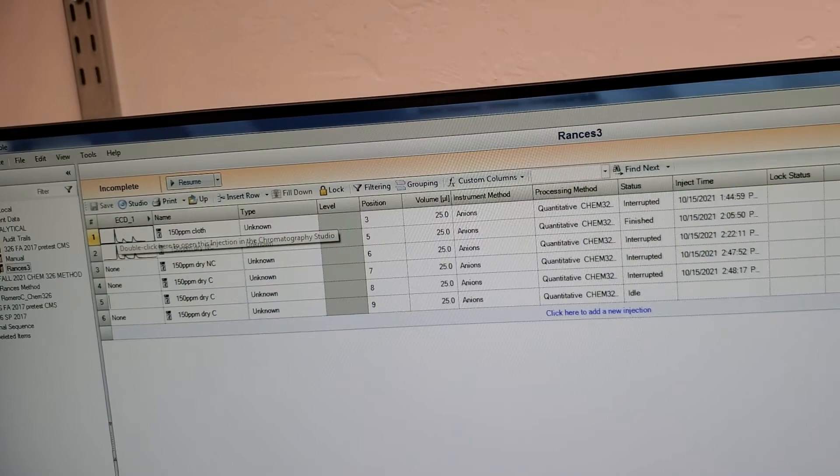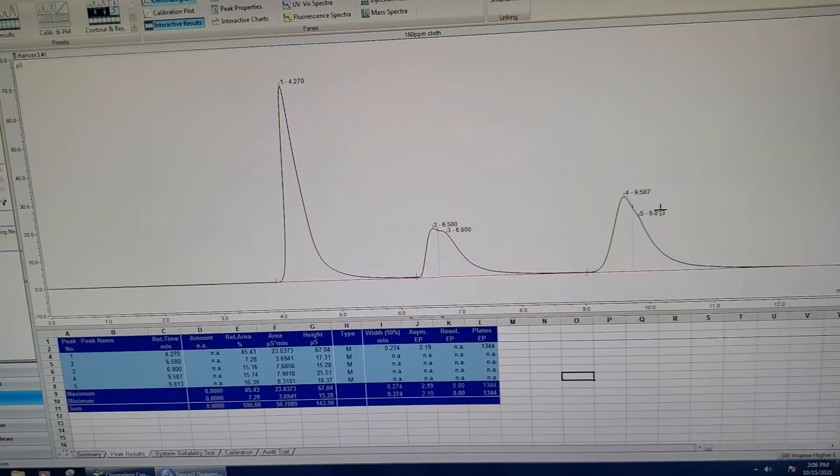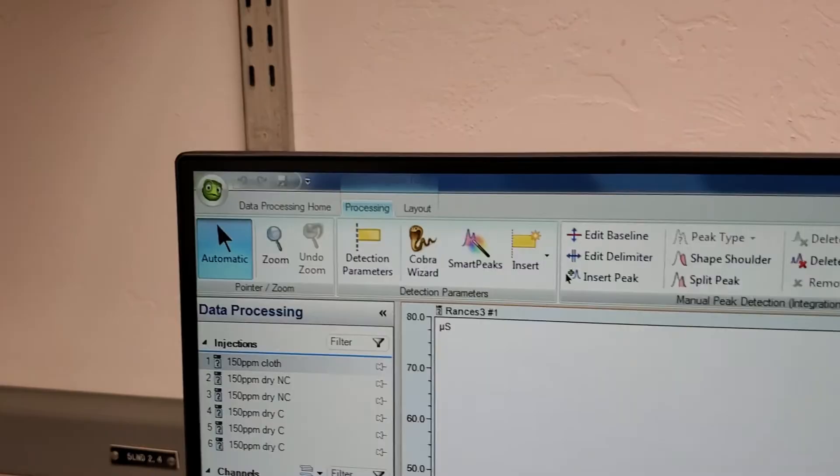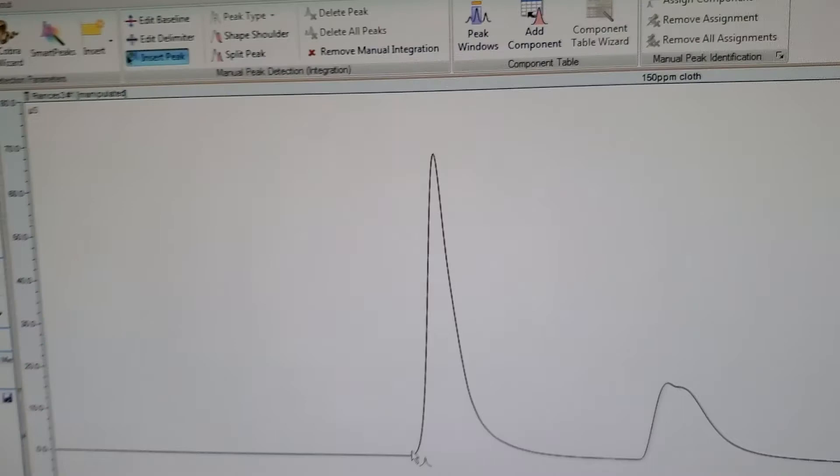Usually this integrates on its own, but it's not quite right. Go to processing, delete all peaks, then click on insert peak. You can integrate your own way, like this one right there.